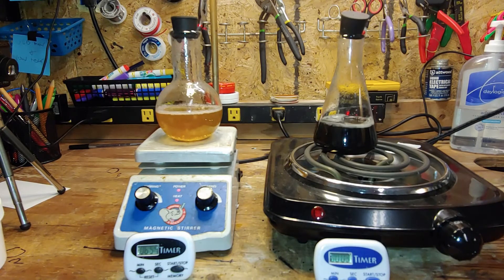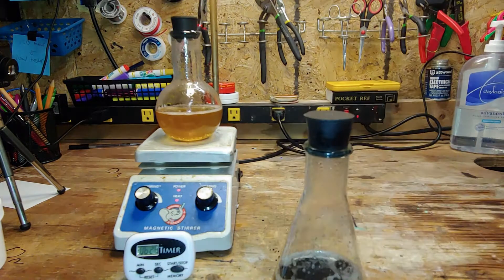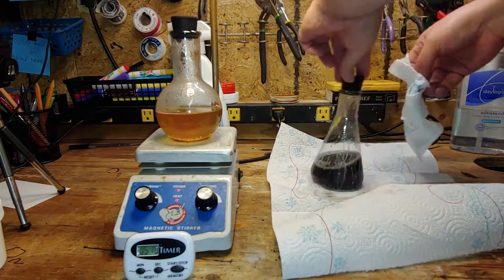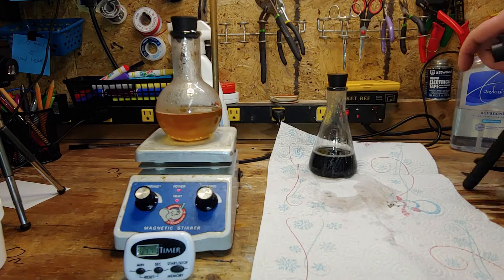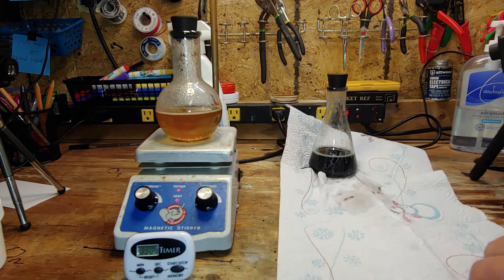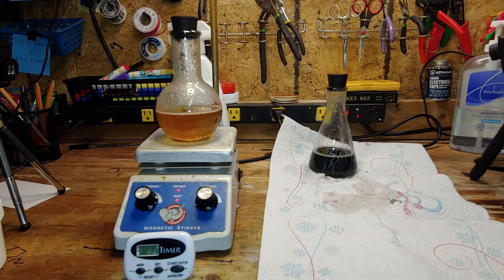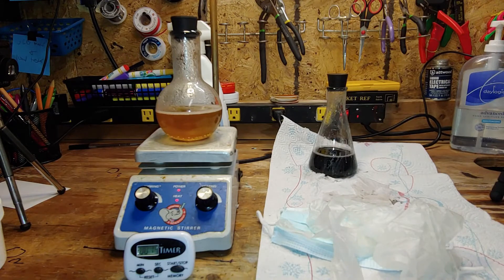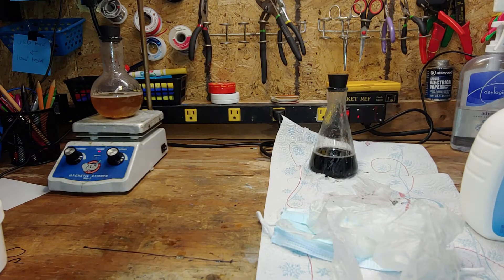The flask on the right is done boiling, so we take it off the heat and remove the burner from frame. Lay down some paper towel and place the flask on top. Spray with bleach. Get a pair of gloves and a procedure mask, and wait for the flask on the left to get done boiling. Finally done boiling, so we move the whole setup out of the way, turn off the heating, and then turn off the stirring.